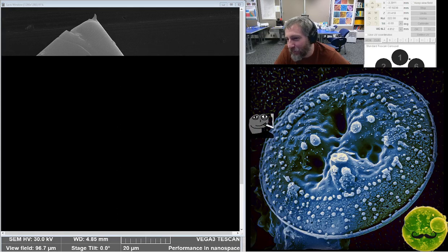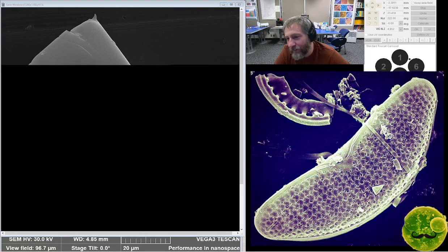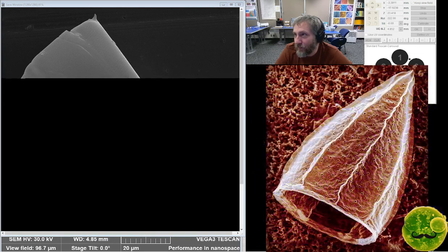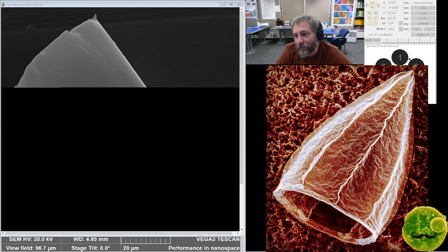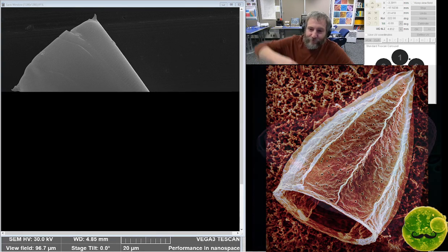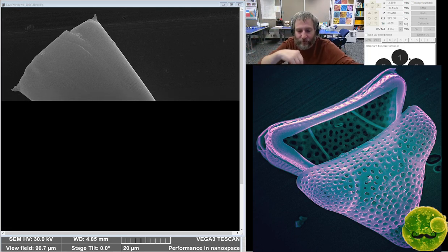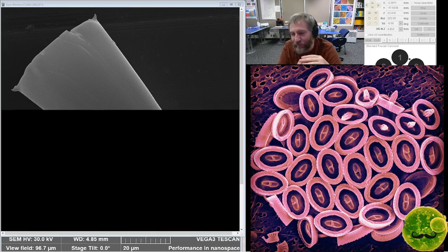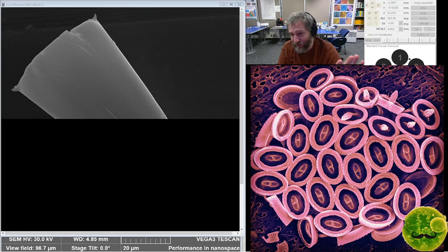Could I explain a little bit about the difference between an SEM, an STM, and an AFM? I don't know what an STM is. Do you mean a TEM? I'm not sure of the exact terminology you're talking about. But a scanning electron microscope fires electrons from above onto a sample, and the electrons go into the sample and collide with things. I don't know what a scanning tunneling microscope is, actually. I don't think we use them in my field. I'm not an engineer, I'm a diatomist.